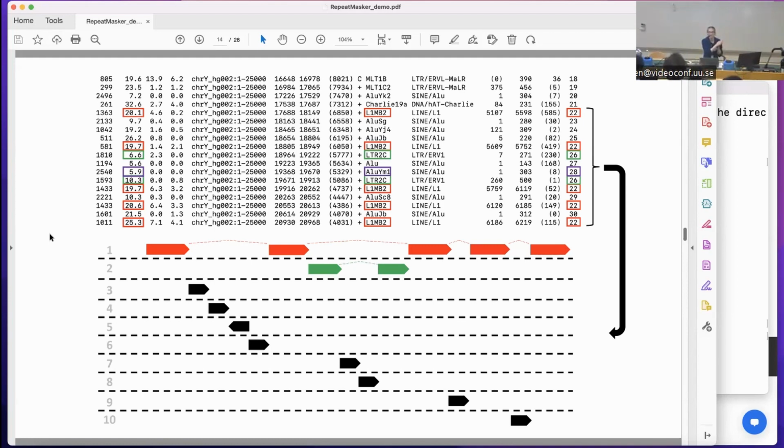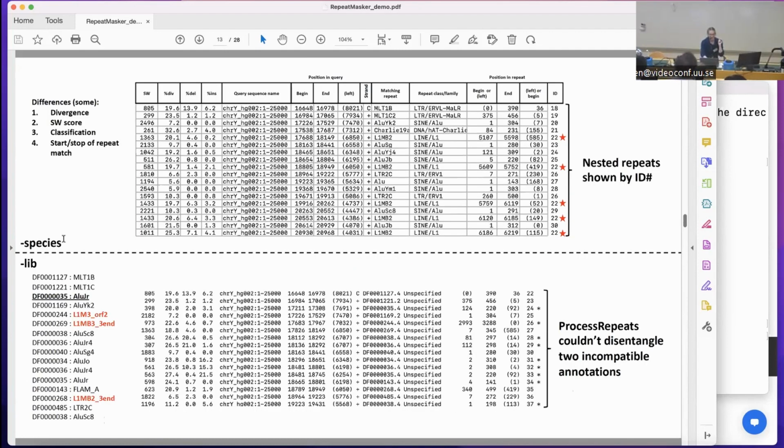So that's why I say, unless you have a really good reason not to include it, always include it in your output. If you don't need it, fine, but at least you'll have it later in case you change your mind.